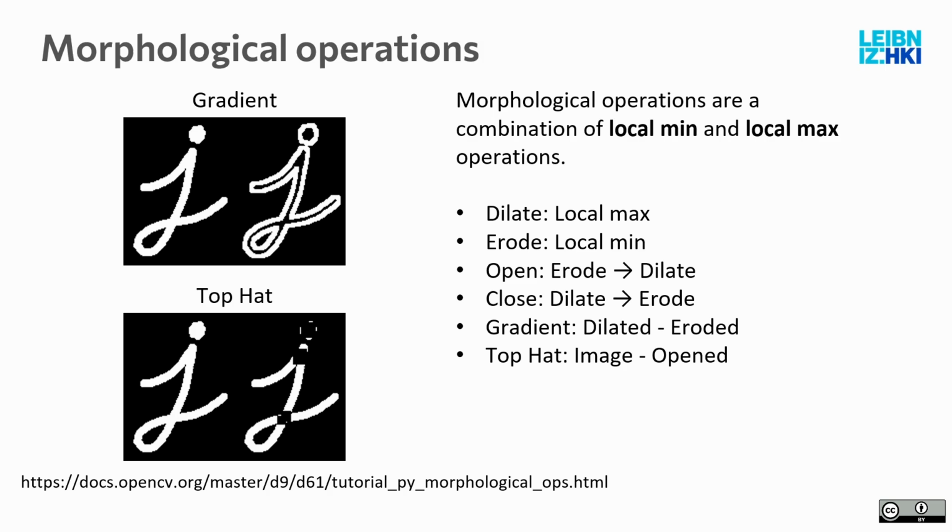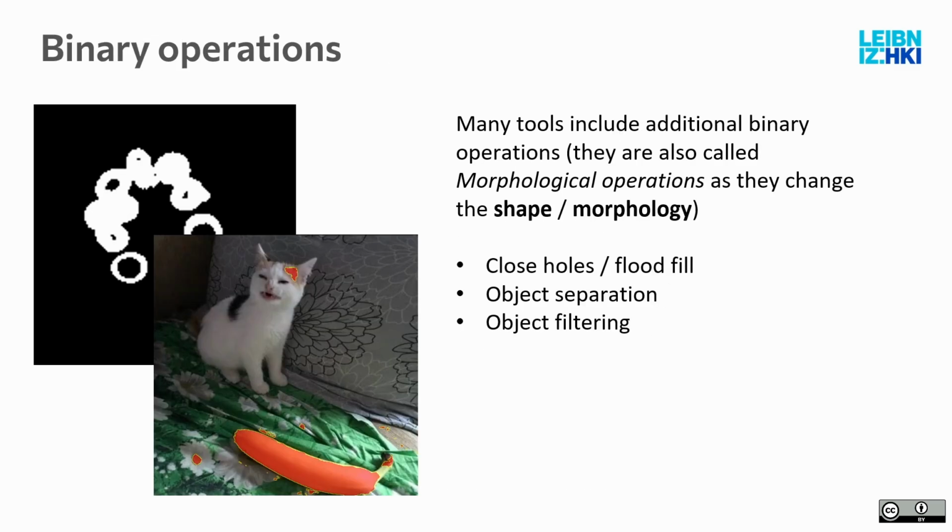This example is not useful at all. So see it as local minimum, local maximum. It opens up more possibilities than binary, on what it is usually defined on. You can use this gradient. It's very useful for visualization, for example.